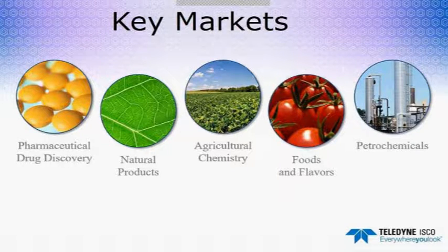What do I recommend for purifying two compounds that have very close RF values and very hydrophobic to run on silica? That's depending on the cause of why they're so closely related. My next choice would be trying C18 because C18 is often good for resolving closely related compounds. And after that, very hydrophobic, I would try aluminum oxide. And then after that, I might try, say, the cyano column. That would be what I would try in roughly that order.